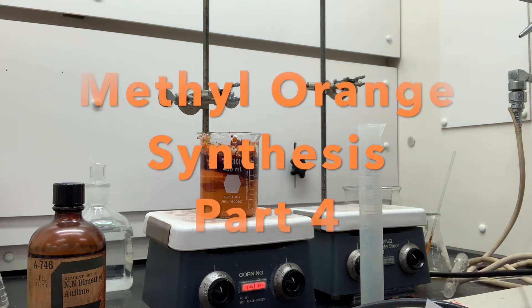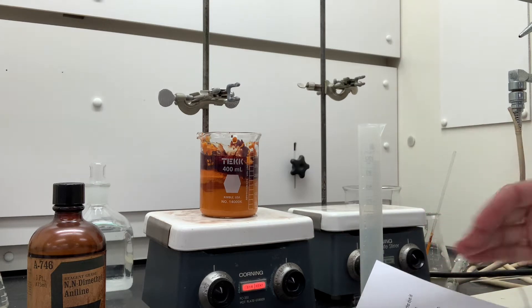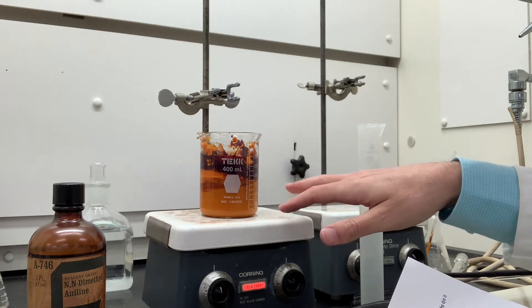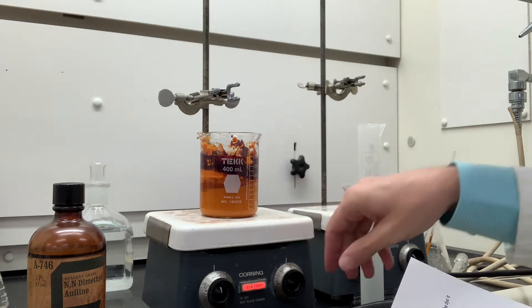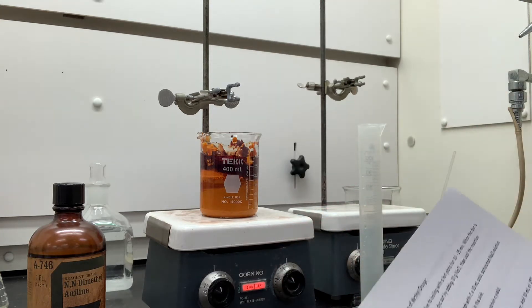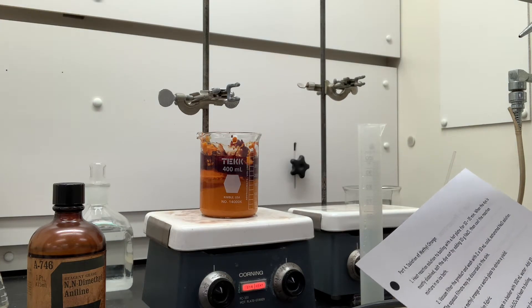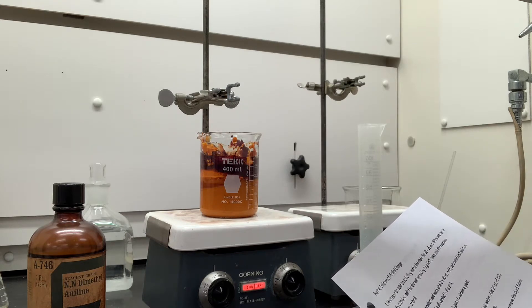This is step four. We're going to isolate the methyl orange now. It's ionic, which means that it's normally water-soluble, so it's a weird procedure. We're going to heat this to boiling on a hot plate for 10 to 15 minutes, turn this up really high here. And then when the dye is mostly dissolved, we're going to add 10 grams of sodium chloride, and this will cause it to salt out — so it's called salting out the dye.